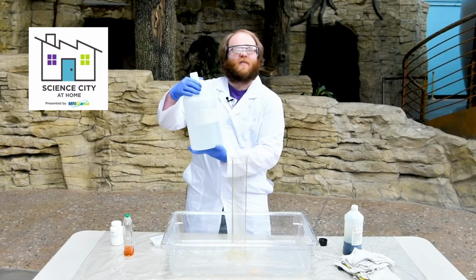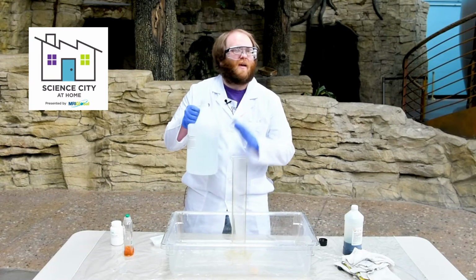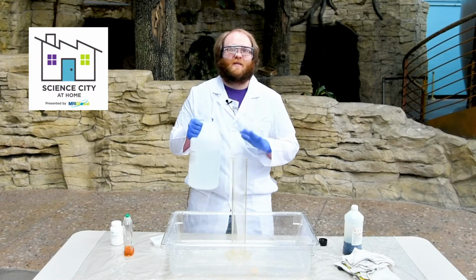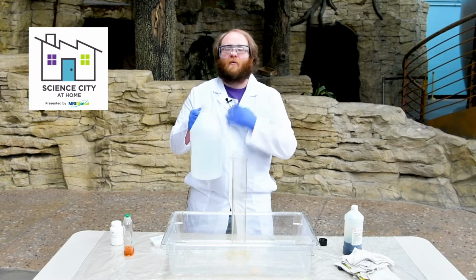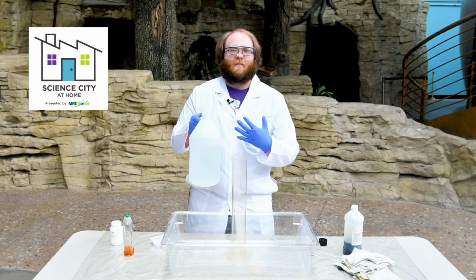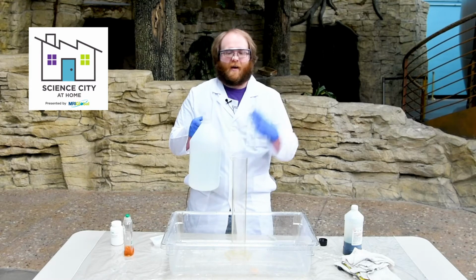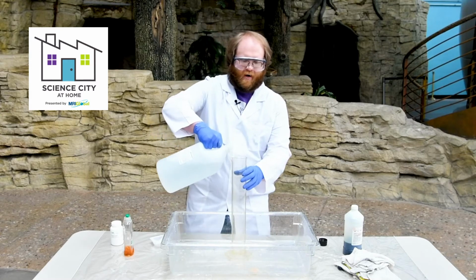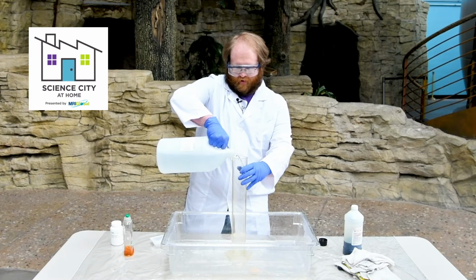This is actually 30% hydrogen peroxide. The stuff you buy for your hair is maybe 10. The stuff you put on cuts and scrapes is about 3. What that means, this is very, very dangerous. That's why I've got equipment on. I've got a lab coat to protect my arms and my body. I've got gloves to protect my hands and even goggles to protect my eyes. So we're going to add hydrogen peroxide, about 600 milliliters or so to our graduated cylinder here.